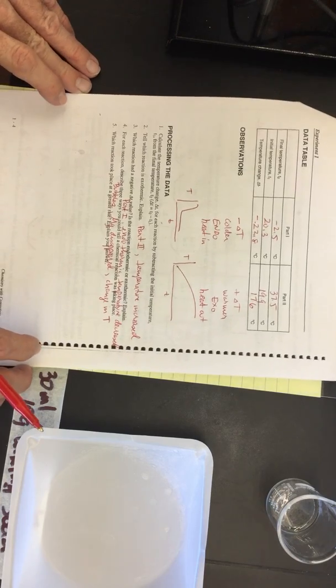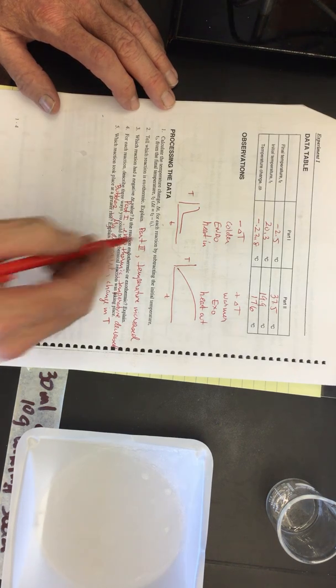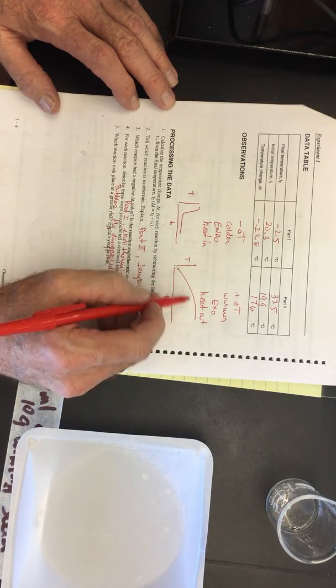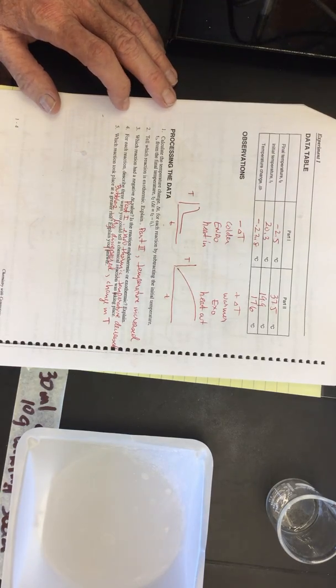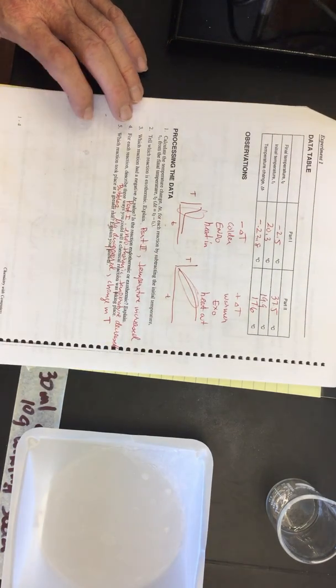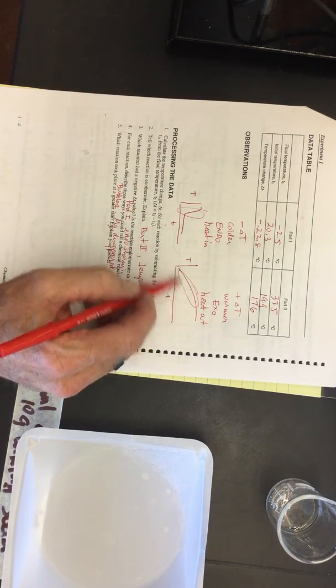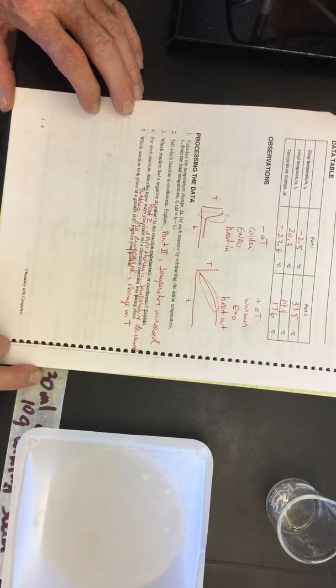Last part is which reaction took place at a greater rate, meaning which one took place faster? Well, this one went for a longer period of time. This one sort of bottomed out. It's not really looking at how long the duration of each of these took place, but it's taking a look at the slope. If you take a look at this part right here versus this part right here, most of the reaction took place within this duration of time. So this chapter is also taking a look at reaction rates.